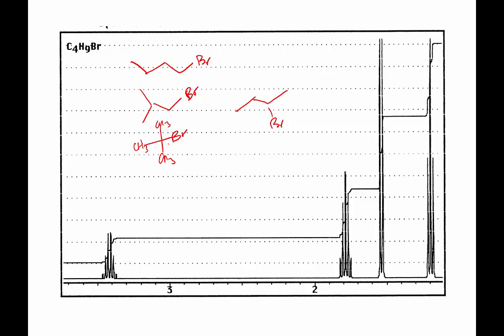So are all 3 CH3s the same? Yes, they are. I like the confident answer, but I just want to move on. So why are all 3 of them the same? Because if I replace a hydrogen with a bromine, I would end up with a 1,2-dibromo. So all 3 CH3s are the same. They're all equivalent. And how many neighboring hydrogens does each CH3 have?